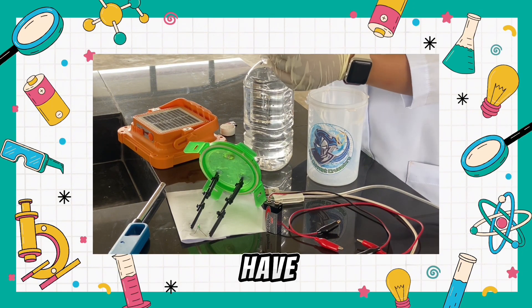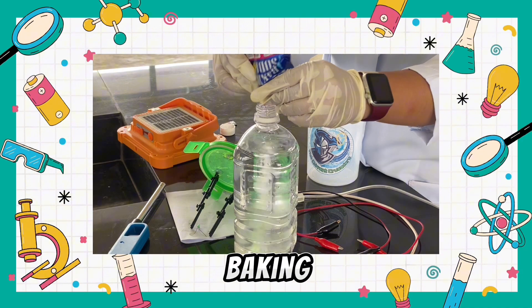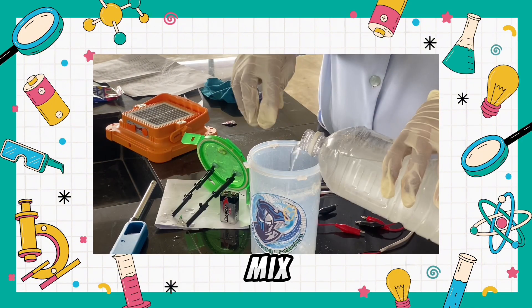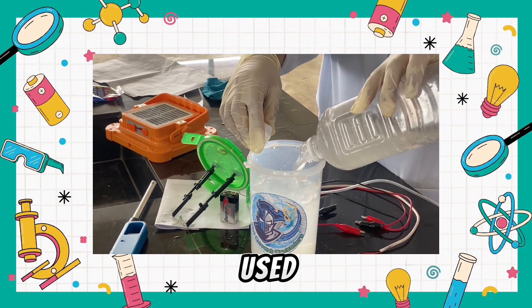First, we have here baking soda. We will put the baking soda into plain water, and once we are done we have to mix it well and put it in the used container.